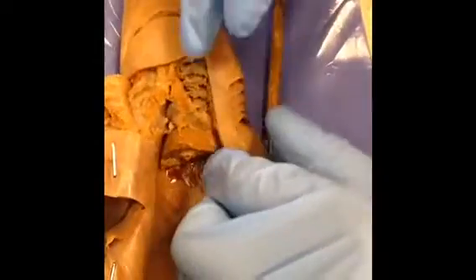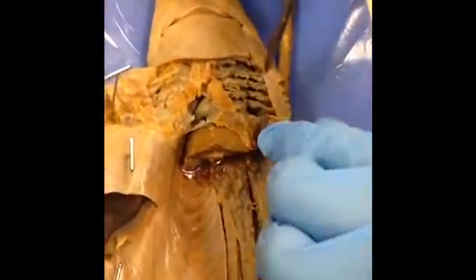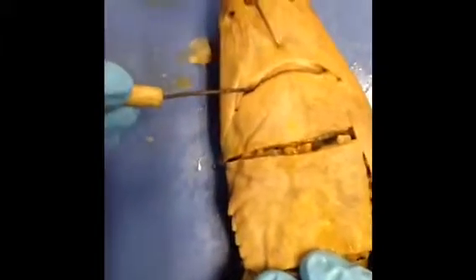Sharks, like all fish, do not possess lungs, so they have to respirate through their gills. Sharks use a process called ram ventilation to bring oxygen into their bodies. This process uses less energy than the way their ancestors did it. Their predecessors had specialized muscles in the cheeks that pushed water into the mouth and over the gills. Now sharks constantly have to move to keep the water flowing over the gills.